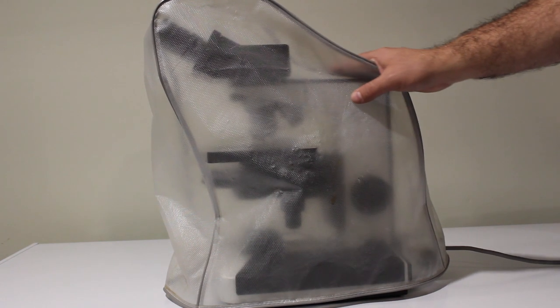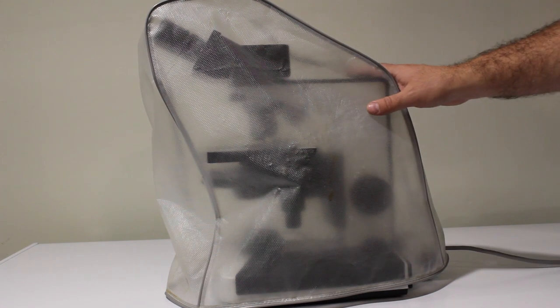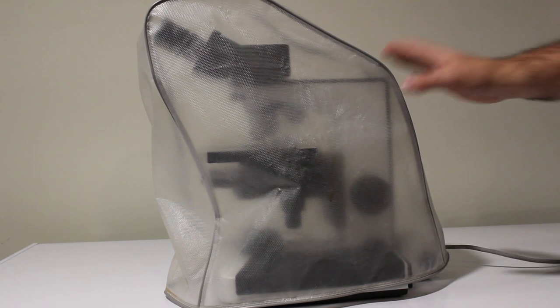So beneath this cover is my microscope, which was manufactured a very long time ago, somewhere between 1957 and 62. As old as it is, the technology in here is the same as you would find in a more modern microscope. And in fact, this particular unit still sells for a few thousand dollars when they come up on the market. The key to the long life is partially due to the good construction of this microscope, but it's also due to the careful care and storage of the scope by myself and by the three or four people who owned it previously.